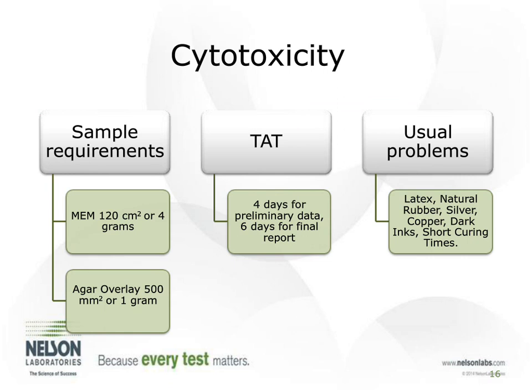And the biggest issue that we're trying to develop in these tests is we're trying to look at an alternative for that sensitization and irritation test that can still be as predictive as the animal test or more predictive than the animal test, but use an in vitro option. And that's kind of a hint of where we're going in a little bit.